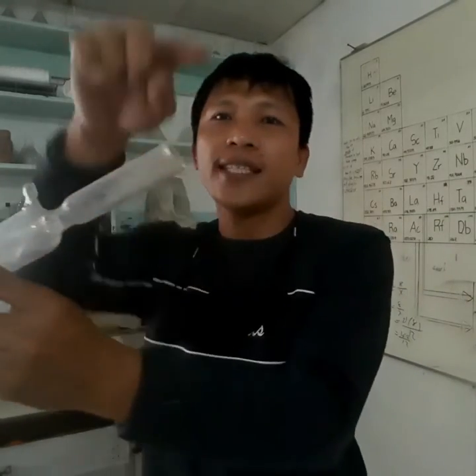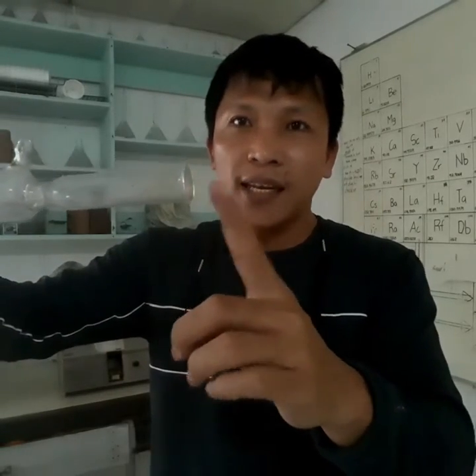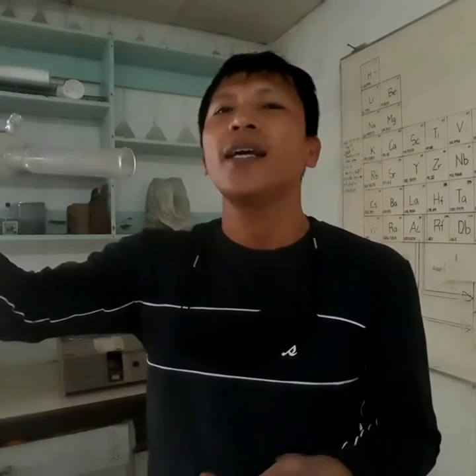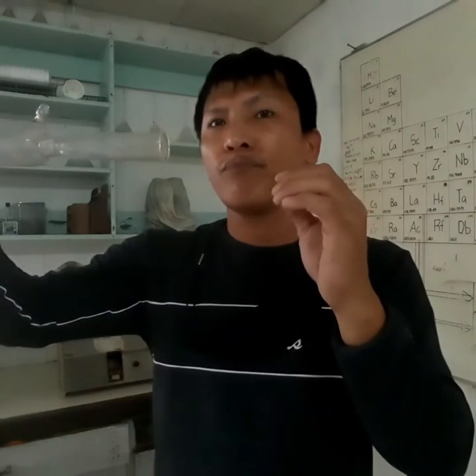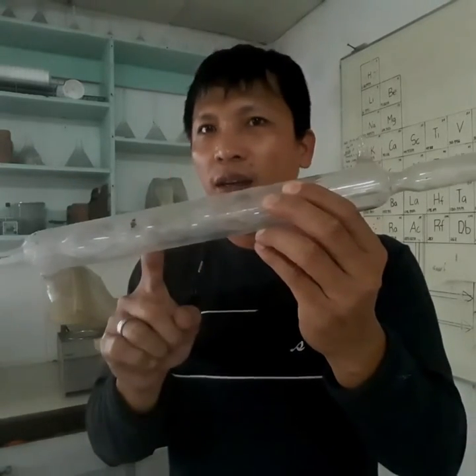Okay, so this is the part where the vapor comes in. Usually there's a connection here going to a reaction mechanism, or probably an Erlenmeyer or a Florence flask wherein you're boiling something and evaporating volatile liquids, meaning they evaporate, rise, and then when they come in contact with a condenser, they become a liquid again.